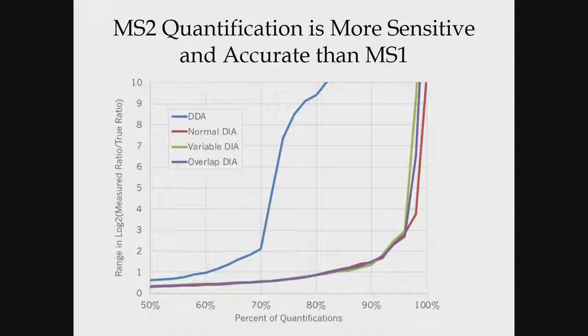That's a really key component of why parallel reaction monitoring has become so popular over selected reaction monitoring. It's not because of anything else other than that if you have interference in a product ion, you have the entire spectrum there, so you can go and pick different product ions for quantitation. And I think that's a really powerful method. Did I answer your question? Okay.